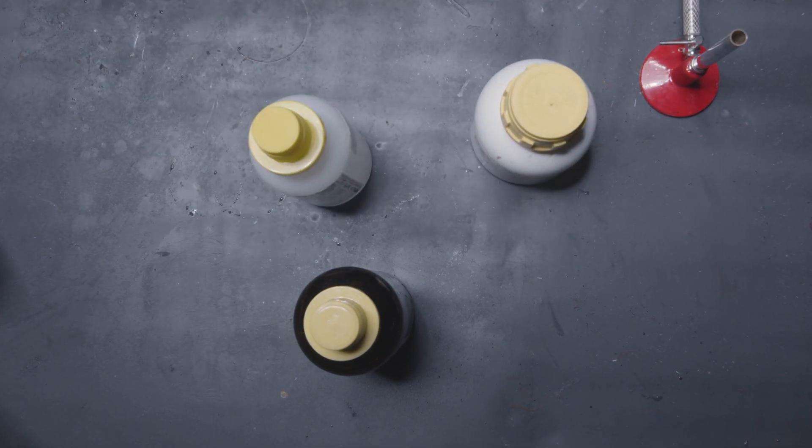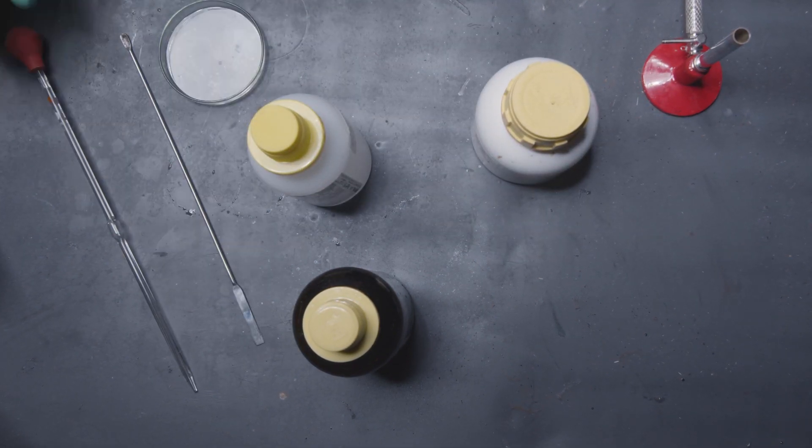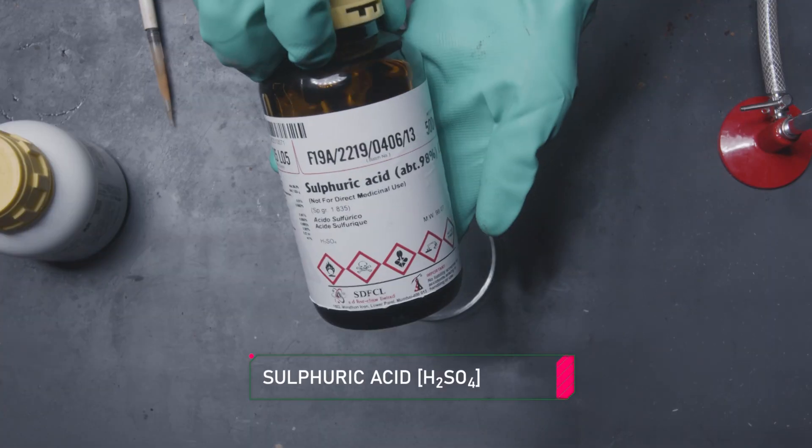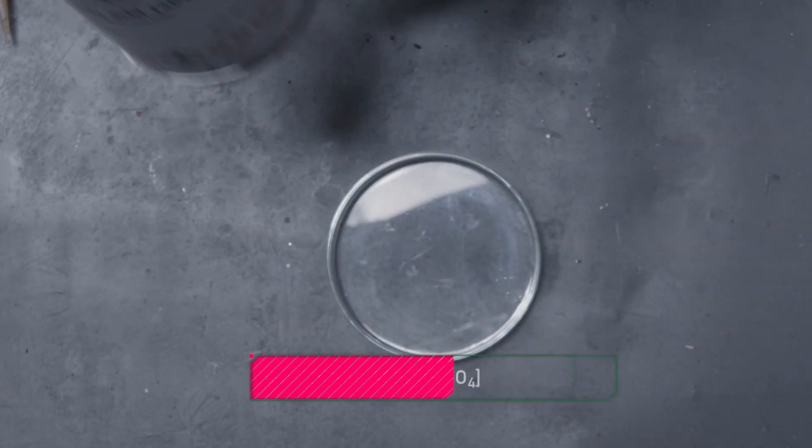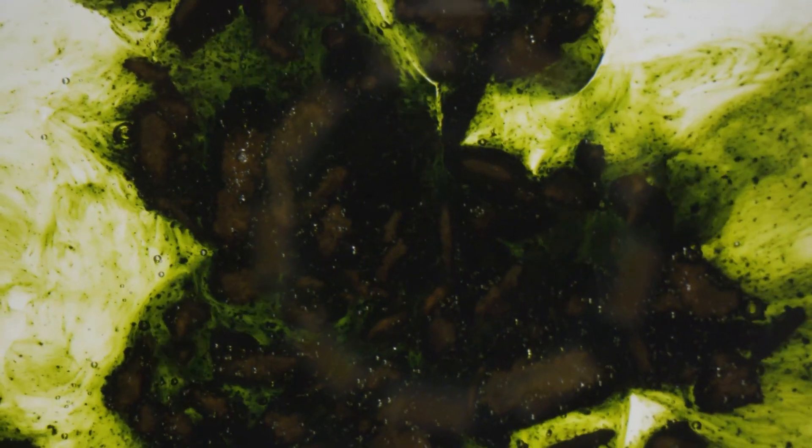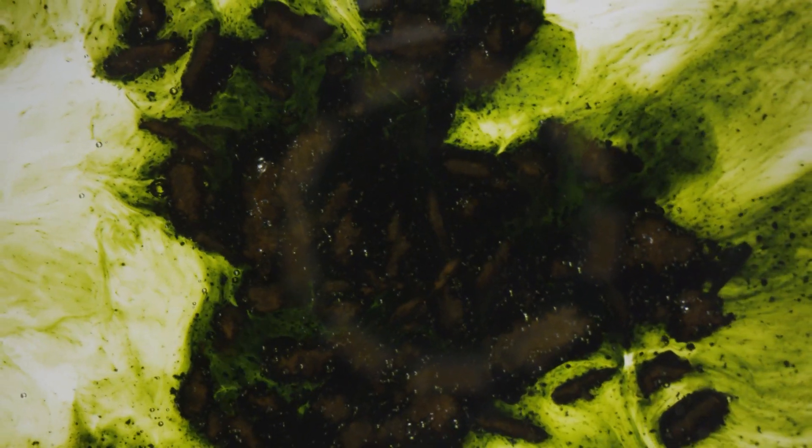So manganese heptoxide is usually made by mixing two common chemicals, sulfuric acid and potassium permanganate. But before we get this party started, there are a few things you guys should know.